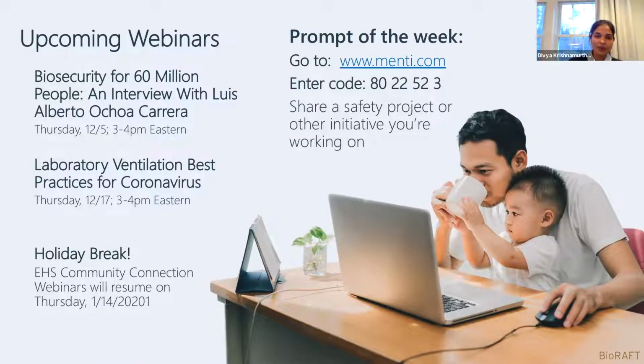We just have barcodes, but what we find, and it was a very difficult undertaking, but if you could do this, if you can somehow move towards an enterprise management system almost, where you can work with your procurement folks if possible, it's a very seamless process. But I will say that it's a hard sell, but worth it if you can try it.